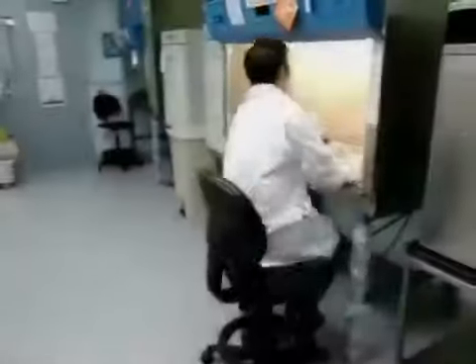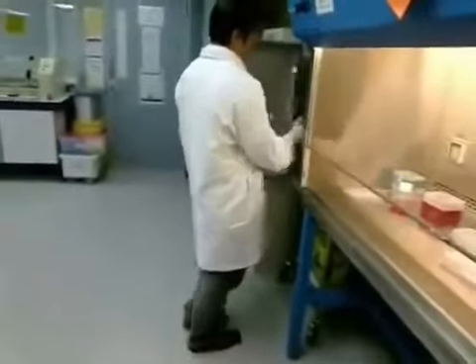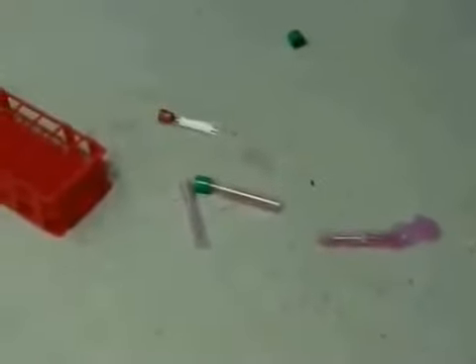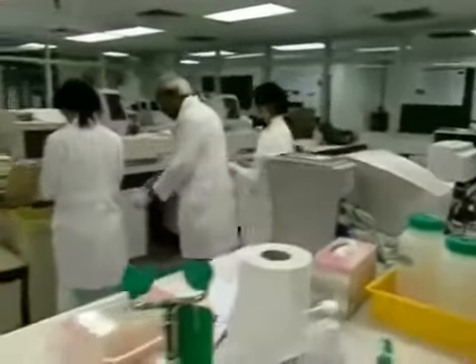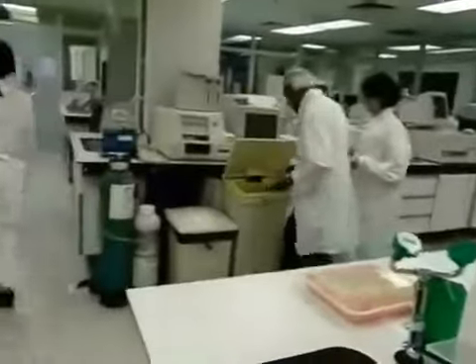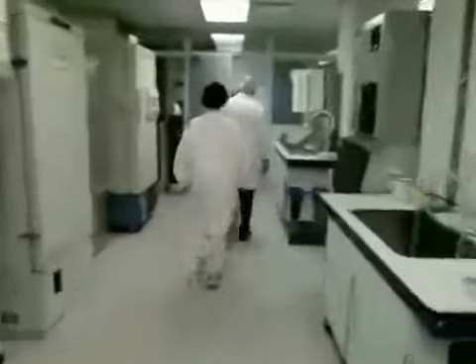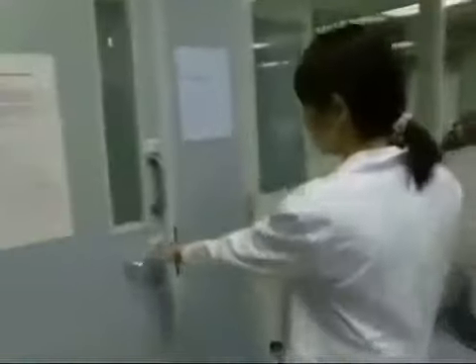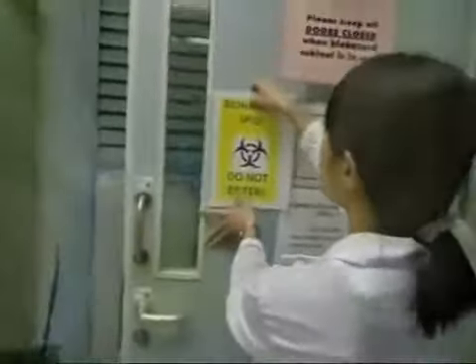Large spills of blood and other potentially infected materials occasionally occur in the laboratory. If you experience a spill of this type, follow the cleanup procedure as shown in this video. Inform those in close proximity to leave the contaminated area, and call another person to assist if needed. Post a no-entry sign on the door and keep people out for at least 30 minutes for any aerosol to settle.